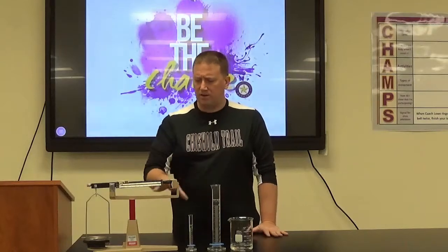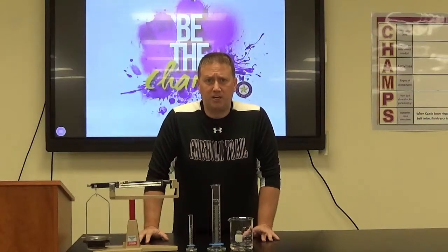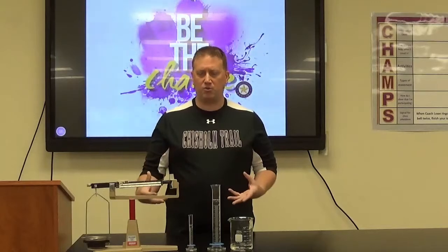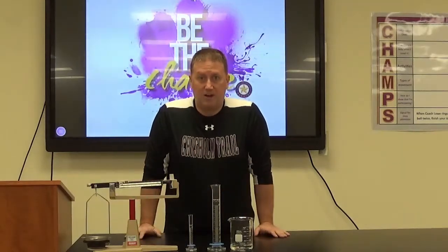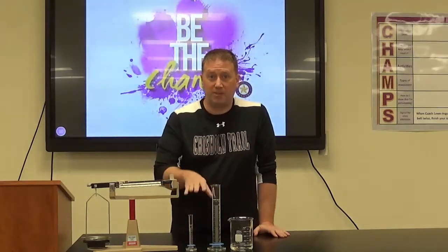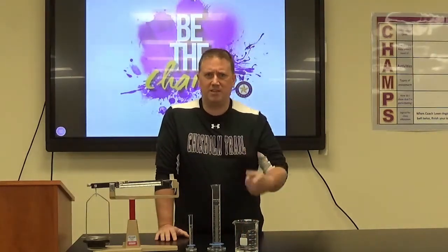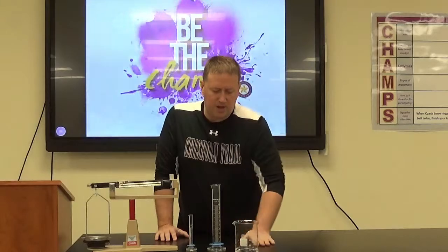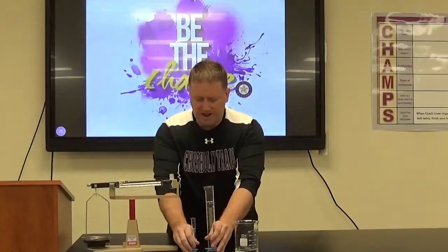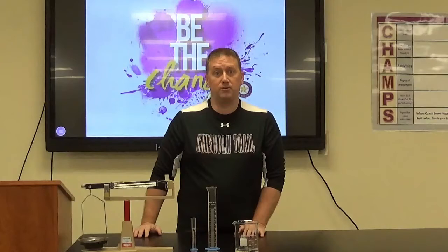All right, so here up on the table, these are really the main things that you'll be using whenever we do labs, whenever we're dealing with chemicals, measuring out chemicals. It'll be one of these three things, because really these two right here, these are the same thing. Here we just have a beaker, and I'll zoom in here in a second, but I've already filled it with a little bit of water. Here we have two graduated cylinders, and then third we have a triple beam balance.